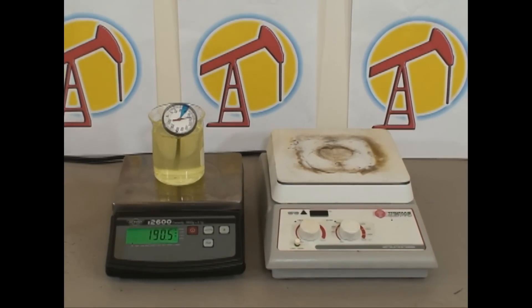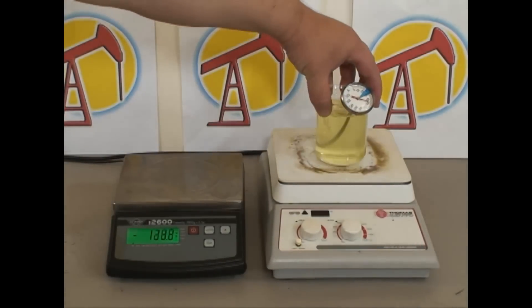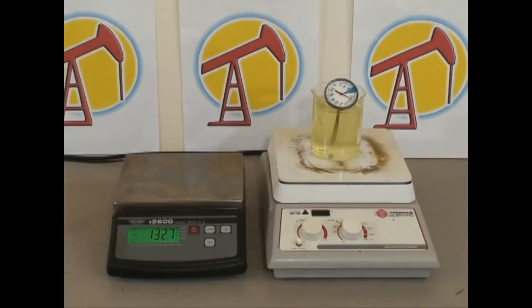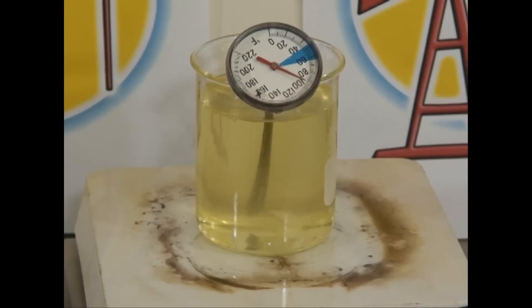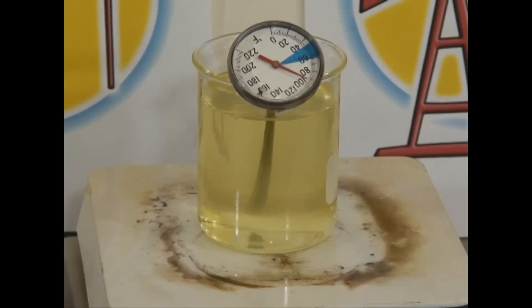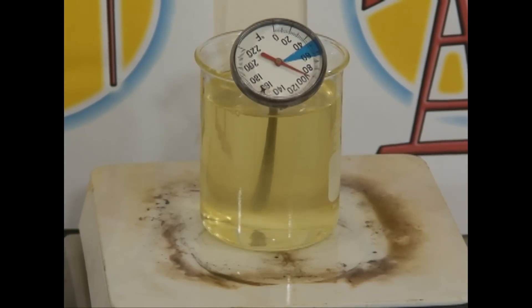So now we move this over to the hot plate stirrer and boil the water out. I skipped over the adjustments for the hot plate stirrer to save time. Let's take a closer look at this beaker — as you can see, the oil in the beaker is a little bit cloudy or turbid.